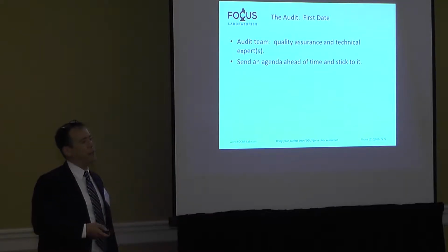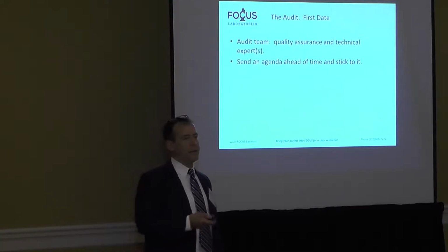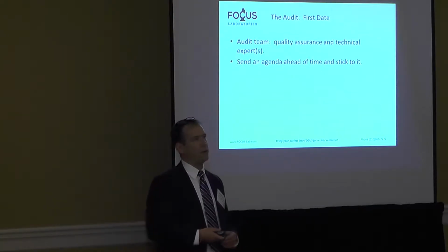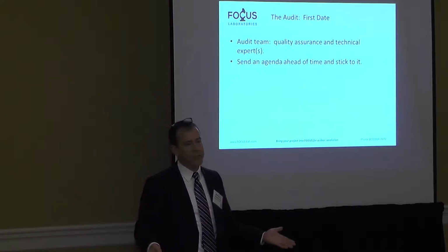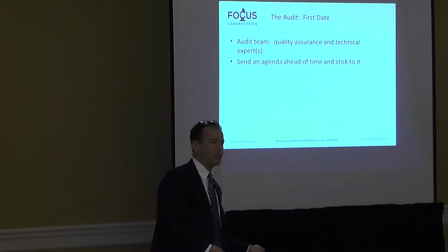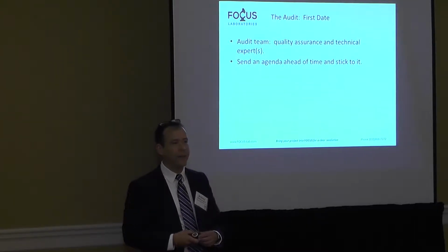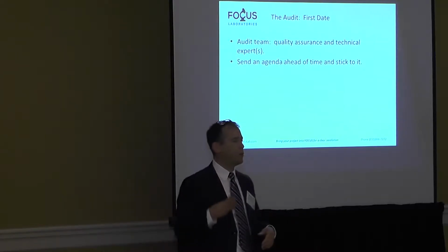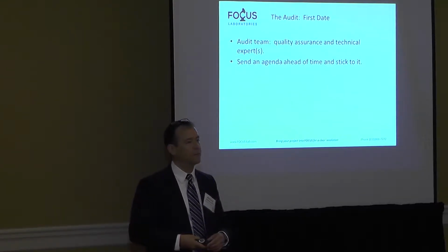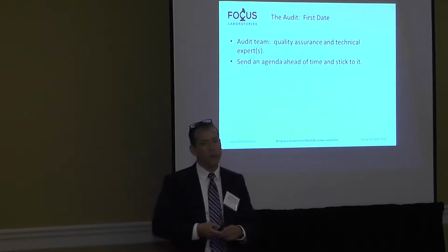Send an agenda ahead of time and stick to it. And this is something that I sometimes try to get around, and I've seen it happen. We'll have the audit, have the sales team come in, give a sales presentation, start at 9. Oh look, it's 10 o'clock. Do you want some more coffee? 10:30. Well, I really want to see the lab. Okay, let's go. Boom, boom, boom, through the lab real quick, come back. Want to have lunch? Nice 2-hour lunch. They're getting tired, turn the heat up in the audit room.